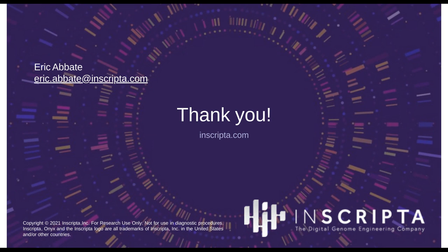And then it also depends on the number of hits that you get out. If you're able to shallow screen a large library and you get a large number of hits, then maybe you're happy with that number. One of the keys is that you want to identify hits as fast as you can, which usually yields some level of improvement. But the large level of improvement really comes when you start combining those hits into one strain. This has been seen in protein engineering experiments, as well as in strain engineering.